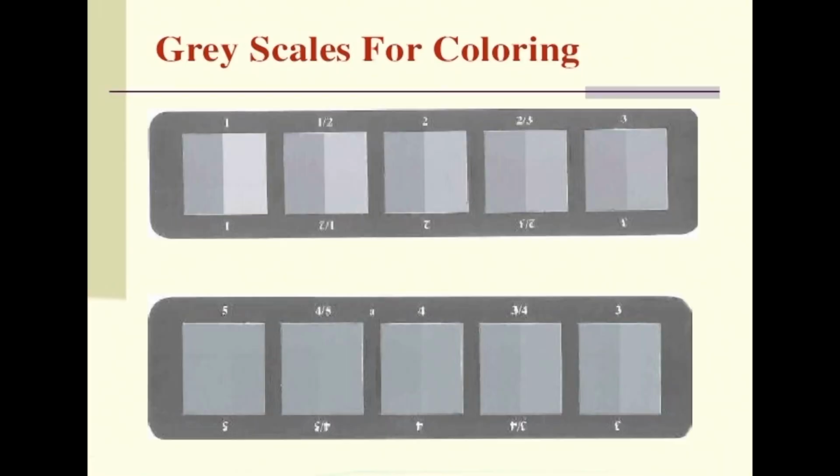As per the standards, the color change in the dyed sample and color stain that happens to the adjacent fabrics are evaluated by comparing the original dyed fabric and the original white fabric that is used in the test procedures. A standard scale called grayscale has been developed to guide the grading of the color fastness. According to the BIS, generally these are the procedures that we follow.